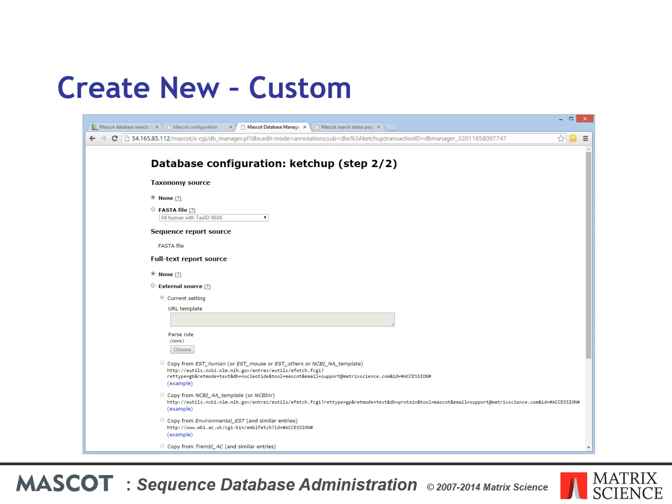Annotation text usually comes from some type of web service. Mascot submits a request using an accession string, and the text is returned and embedded in the Protein View report. This form allows you to select from existing URLs or create a new one. In rare cases, the full text for the entire database is downloaded as a local file. The only common examples of this are the Swissprot and tremble.dat files.